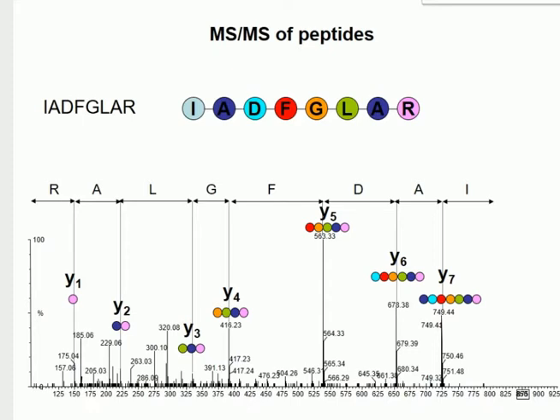Well, yes, except you don't need the entire sequence to be able to identify the protein. Yeah, you don't need the whole lot to be able to identify the protein. We've got a quiz that we'll do probably next time, so I don't think we're going to reach it this time, which will show you why you don't need to see the whole sequence. But yes, that is the idea. So you take the protein, you cleave it up into peptides, you take the peptides and then measure them by mass spectrometry and fragment them to get the sequence of the peptides, and then you piece that all back together again to find out what the protein was. Yeah? Okay.